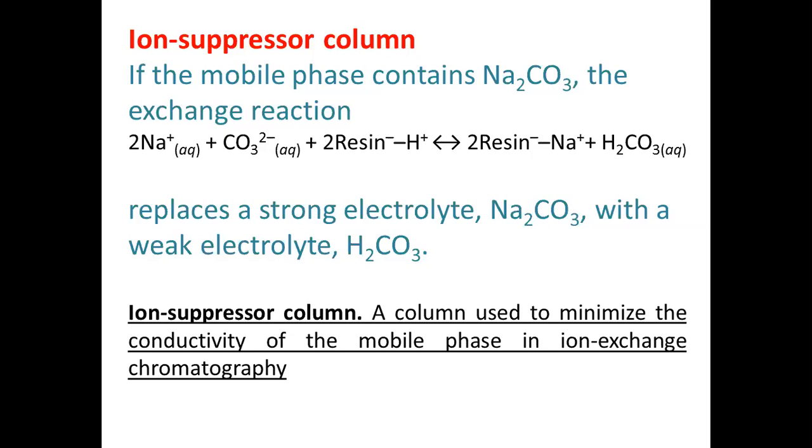So why and how we are going to suppress the electrical conductivity by means of this suppressor column. Similarly, the conductivity of sodium carbonate is going to be suppressed by using cation exchange resin in the H+ form.